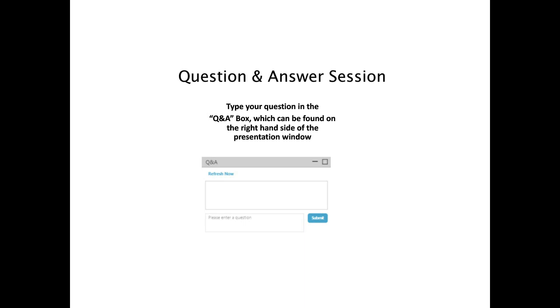Yeah, but let me also add that in general, the more detectors you have, the better view you get of the sample. Each detector adds a new dimension. Of course, for process control or quality control, you don't necessarily want too detailed a view, because you want to have a release criterion or a clean measurement. And the robustness of the viscometer, because it doesn't see the particles, makes it ideal for that.